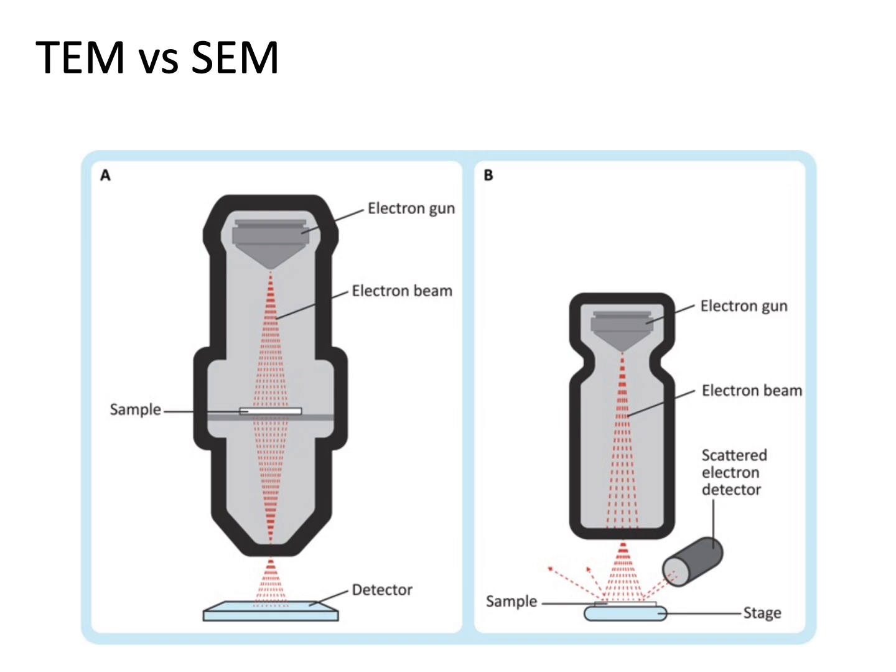Sometimes those have to be treated. If you were to take a fruit fly, it might work if you just threw it under there, but you're usually better off dehydrating it, because all of this has to happen in a vacuum, because everything else would introduce noise. So dehydrating it makes it resistant to the vacuum. And then you come in with something called a sputter coater, which basically coats your sample in a thin layer of gold, and that's electron dense, right? So then electrons are really going to bounce off your specimen because it's been coated in some sort of metal.